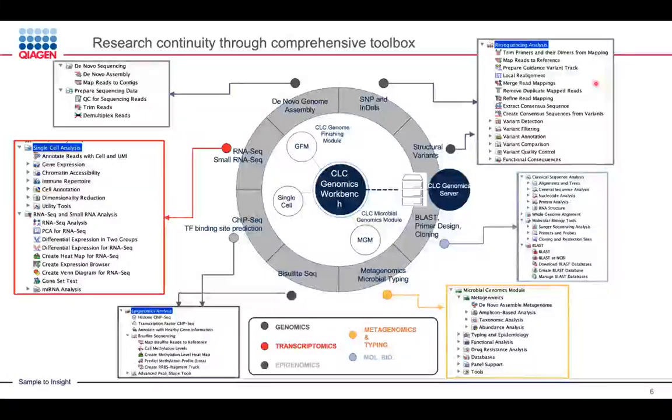So your SNP, indel, structural variant calling functionalities are actually part of this Genomics Workbench as well. Continuing around, there's actually a lot of general bioinformatics stuff, traditional as I like to call it, right? Alignments, phylogenetic trees, Sanger assembly, primer design, BLAST searching. So again, a host of other functionalities.